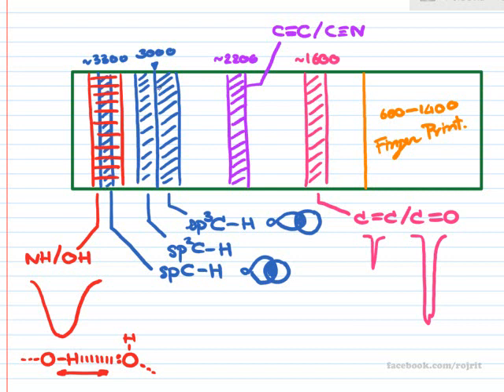If you have absorption lower than 3000, it is the absorption of an alkane. But if you have an alkene, the CH of the carbon double bond, it's an sp2 carbon, so it's slightly higher than 3000. But if you have an alkyne, C single bond H with the sp hybrid carbon, it appears around 3300. So that's the alkyne.